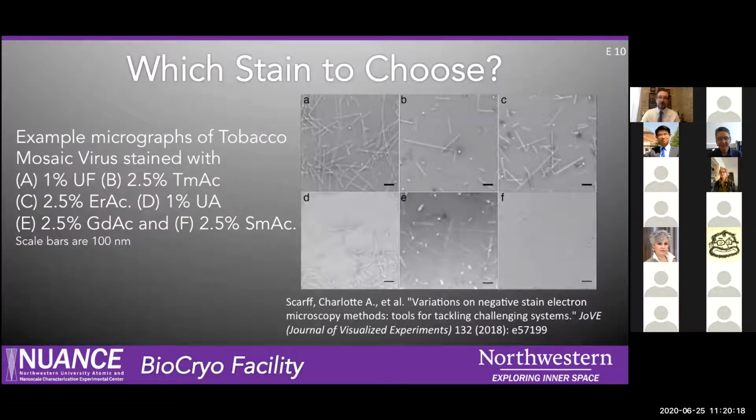All right, so what type of stain do you want to choose, right? If not uranyl acetate, then what?